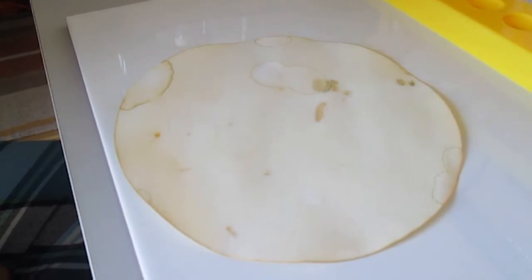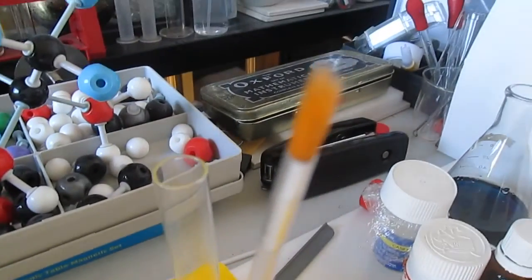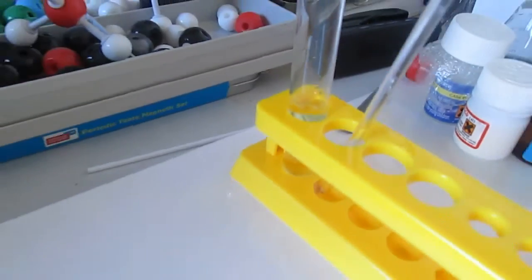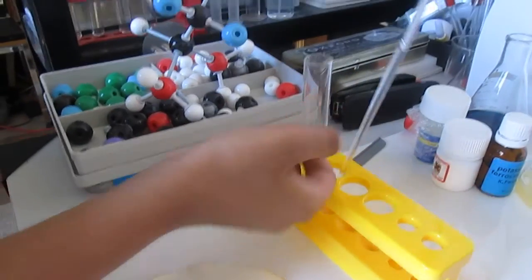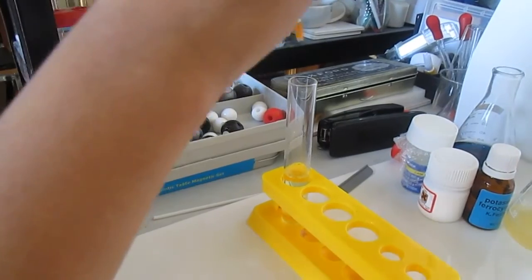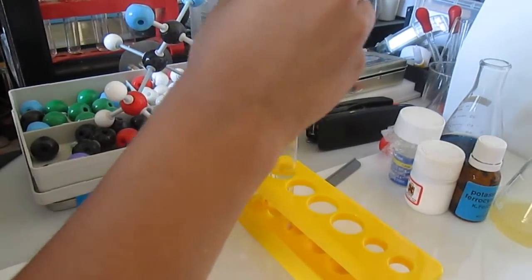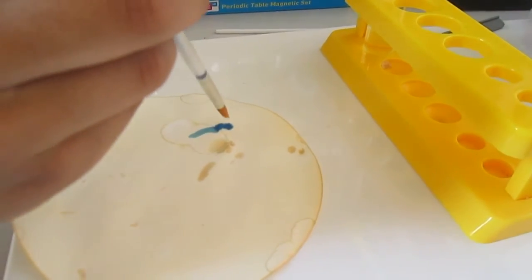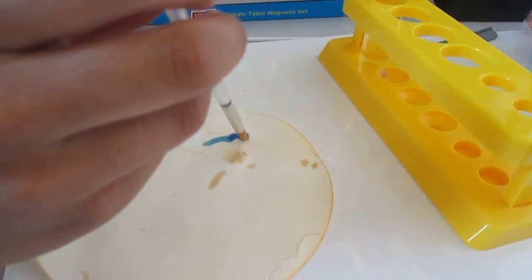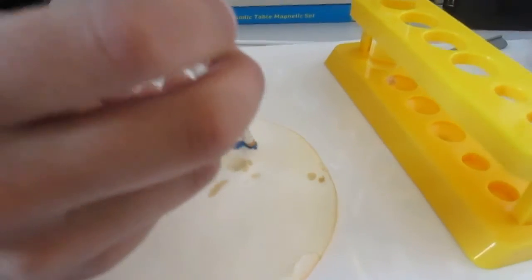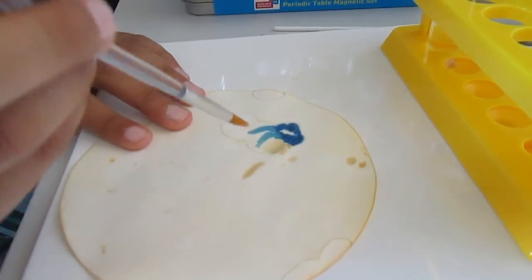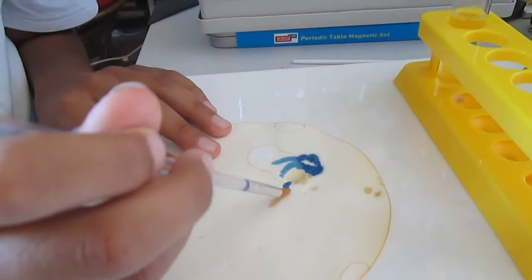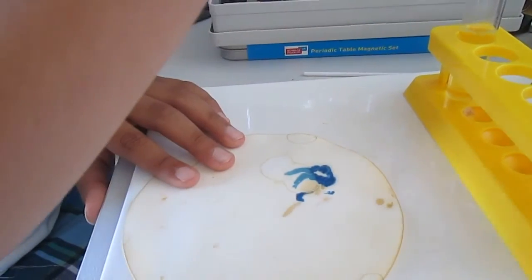I will now dip the paintbrush in a clear solution of potassium ferrocyanide and start writing on the filter paper with it. There we go.